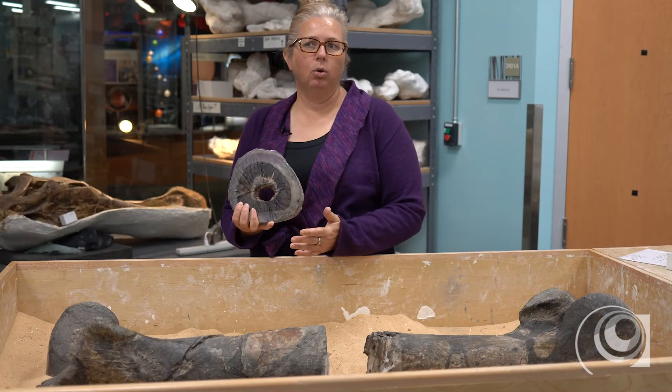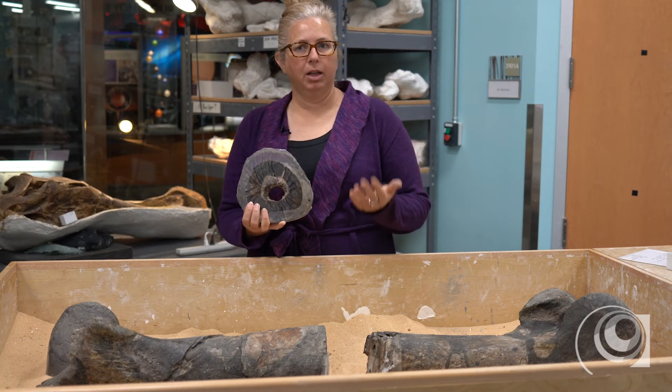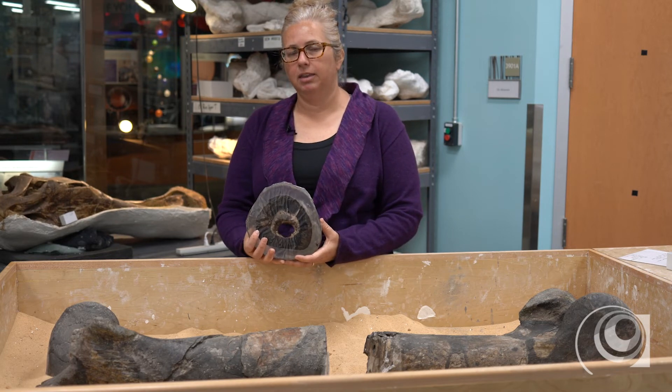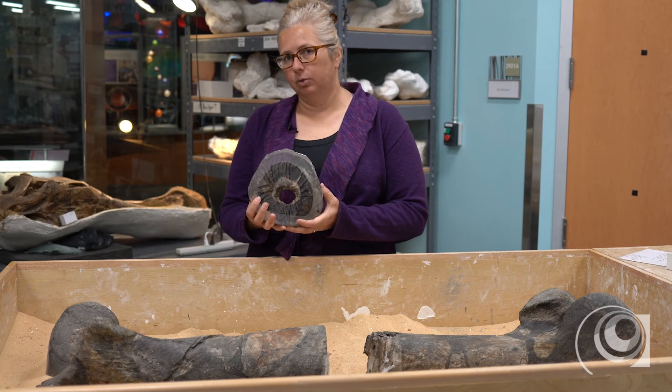Was it really really old? Was it a teenager? Was it still growing? We can tell that by looking at the specimen in this way. This is actually a pretty common method in paleontology, especially for this type of dinosaur.